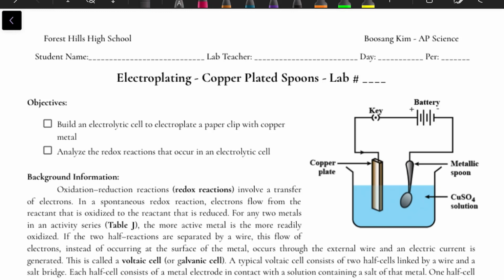Hey everyone, welcome back. This is another lab walkthrough video, and this lab is electroplating. You're going to be making copper plated spoons.